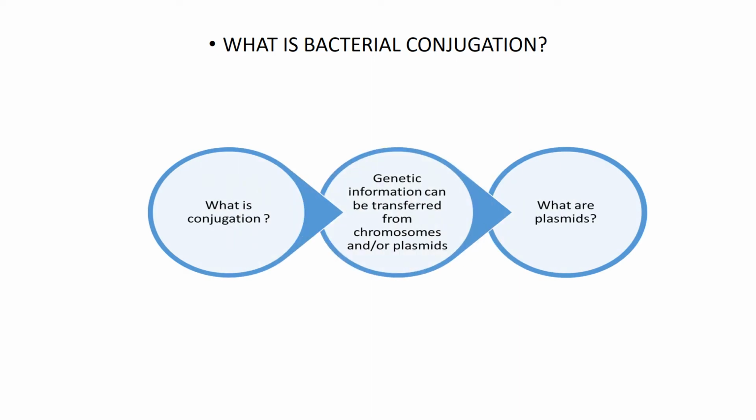While bacterial chromosomes normally carry all the genes necessary for growth and reproduction, bacteria also contain genes carried on extrachromosomal DNA called plasmids. Plasmids are double-stranded circular pieces of DNA that carry genes. Some of these genes regulate the formation of pili, which are elongated appendages that extend from the surface of the cell. These pili can function as a bridge between two bacterial cells, thus allowing the transfer of DNA from the donor to the recipient.